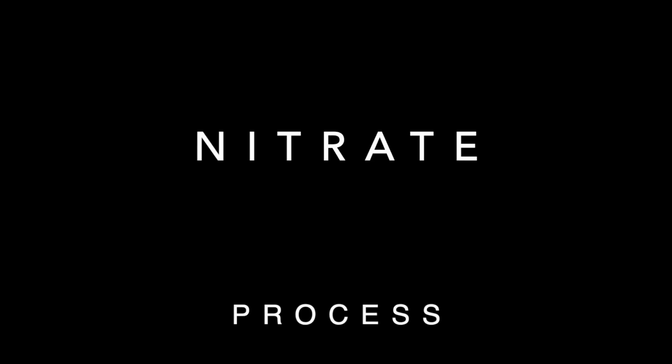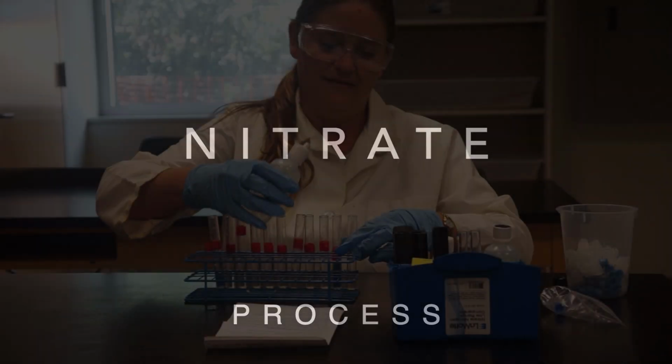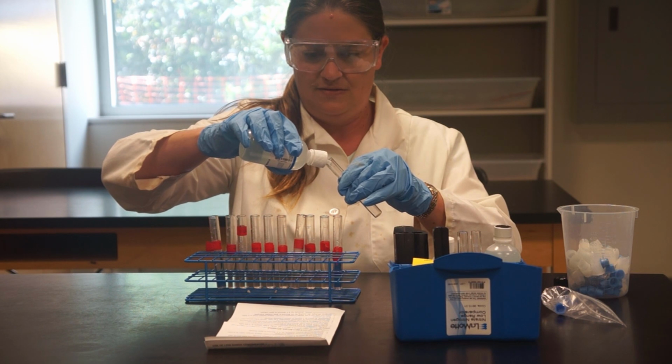Next, we will look at nitrogen in the form of nitrates, another essential nutrient for photosynthesis. The process is the same. We will add chemicals from this testing kit to each depth and wait for a color change.